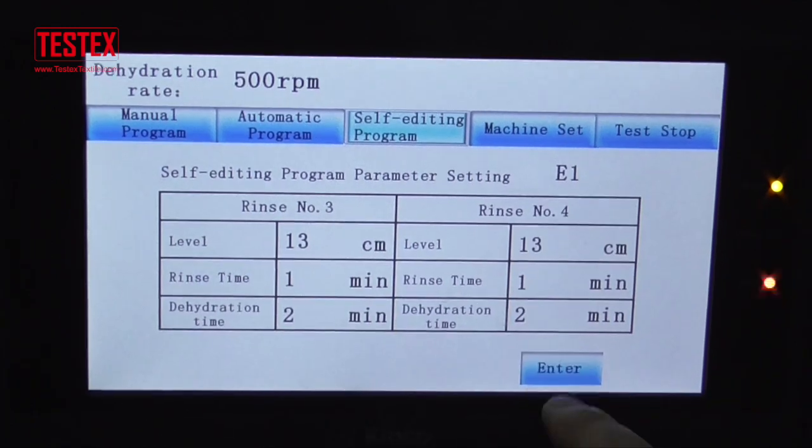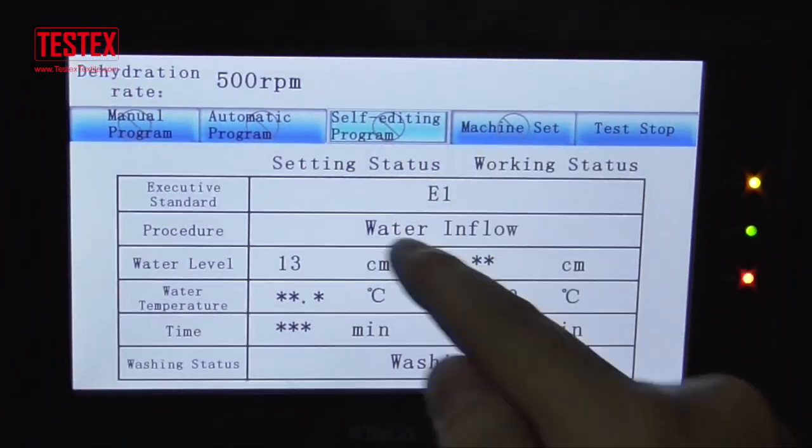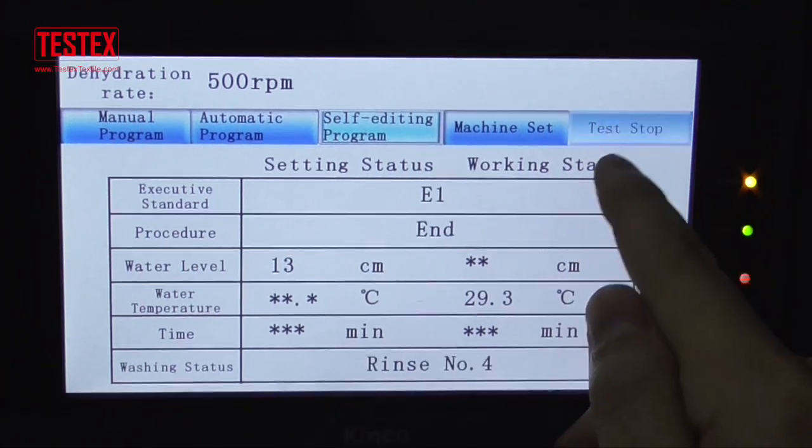we click the next, and click the next, and click the next, and click the enter, and click the test — if you want to take a busy test.